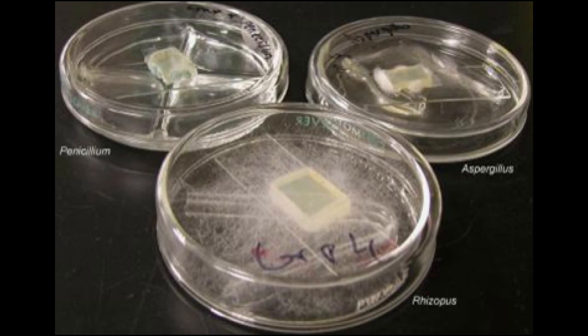To overcome this, slide cultures are put up, which is considered best for preserving and observing the actual structures of the fungus. The method was developed by Riddle in 1950 and currently several modifications are in use.